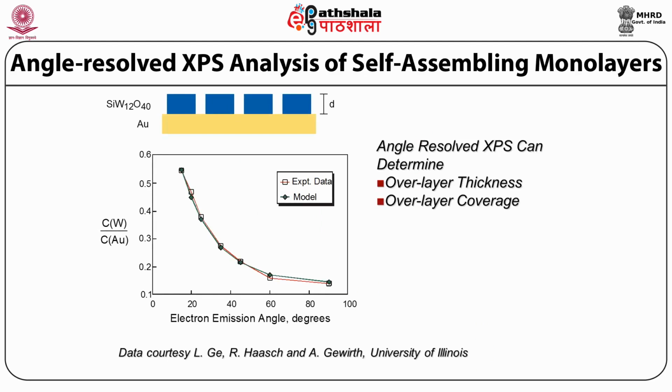Angle resolved XPS analysis of self-assembling monolayers: when we record this, we find that angle resolved XPS can determine overall thickness of the layer and overall overlayer coverage also.